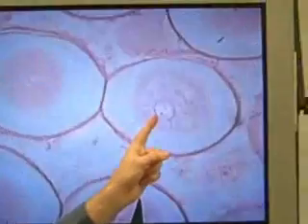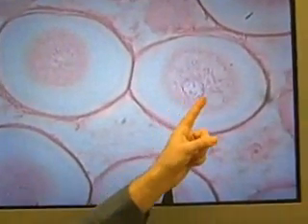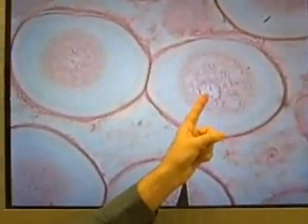Okay, so after meiosis is completed in the female roundworm and fertilization occurs, the egg will actually temporarily have two nuclei. These two nuclei are called the pronuclei. One of the nuclei came from the male sperm, the other one came from the female egg. So the cell, for example, has one pronuclei here and one here, one from perhaps the sperm, the other from the egg. We can't really tell the difference between the two.